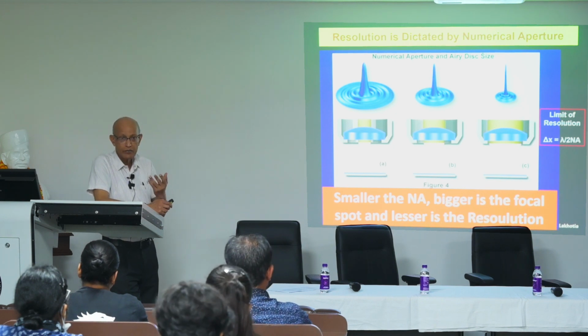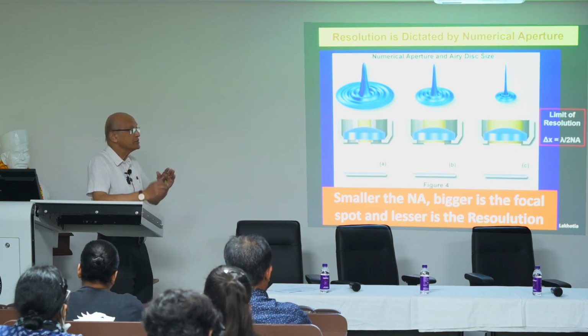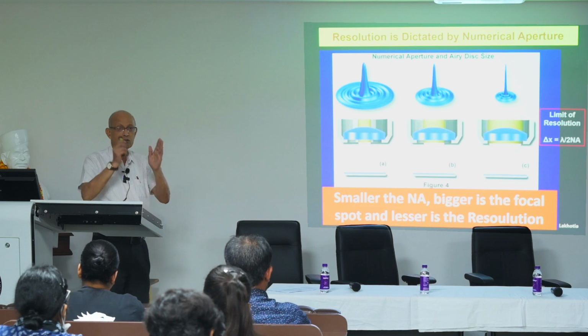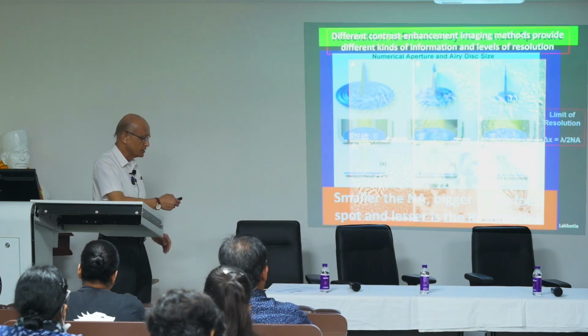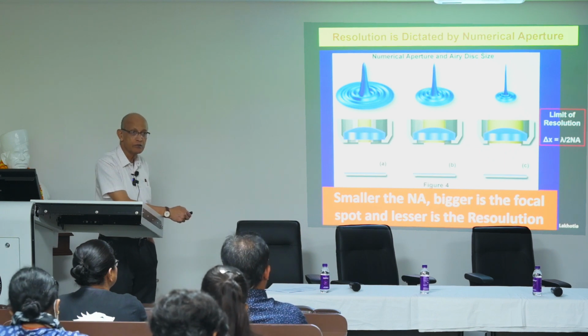They are non-evaporating, and therefore they are used between the objective lens and the slide or cover slip so that light doesn't have to refract again. It can go straight, and you can get the optimal refractive index and the numerical aperture value.